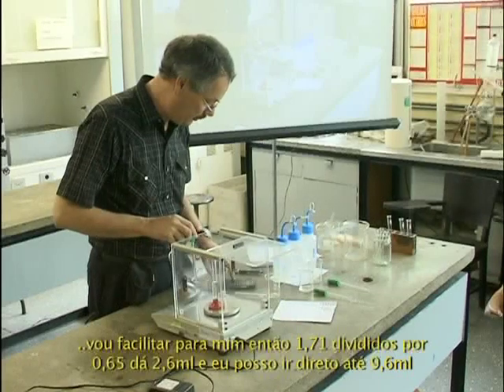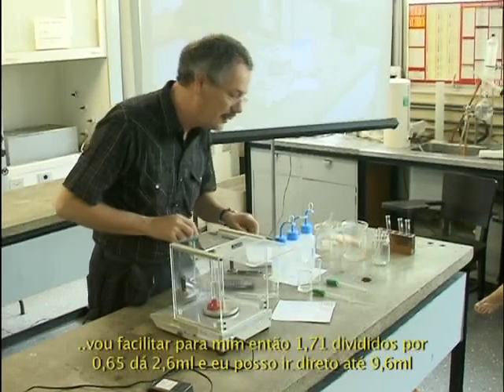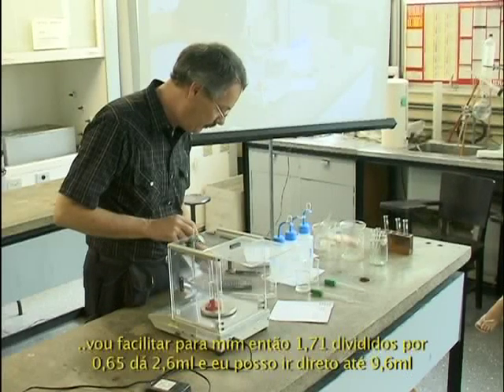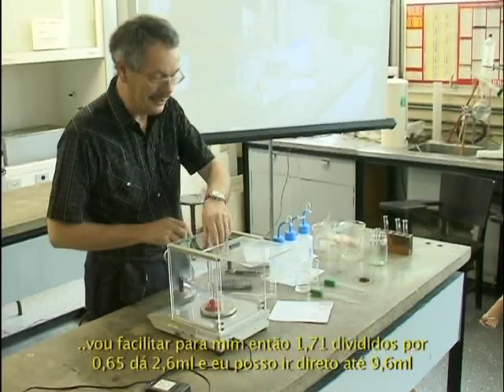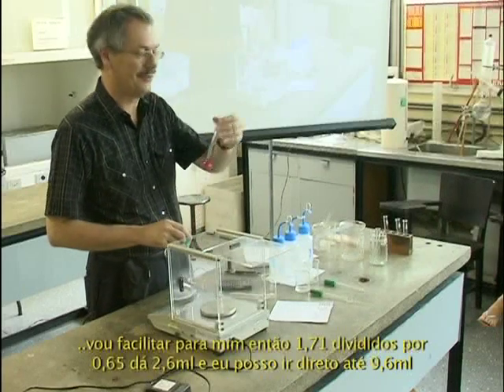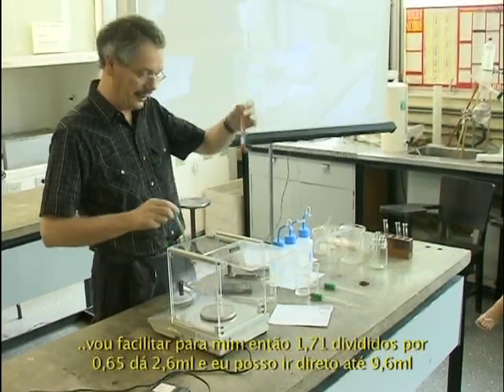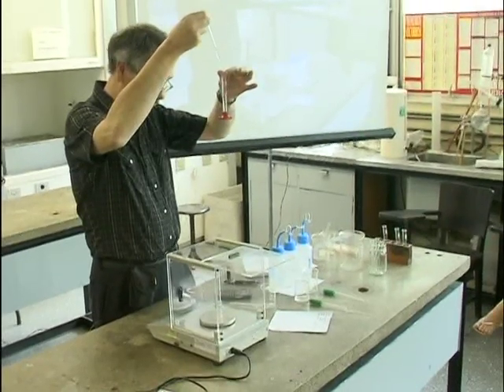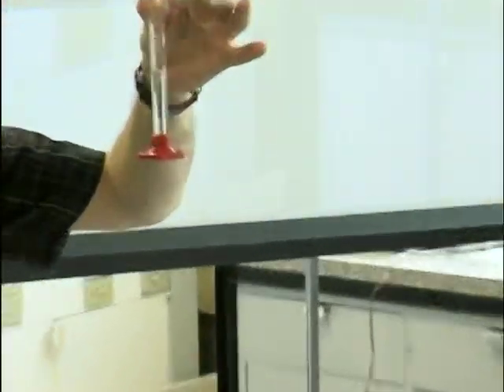I'll cheat a little bit. 1.71 divided by 0.65 makes 2.6 milliliters. So I can go right away to 9.6. Oops. 9.6.